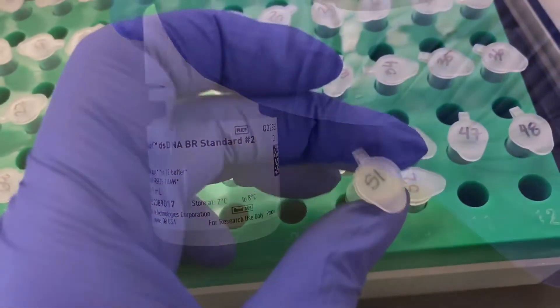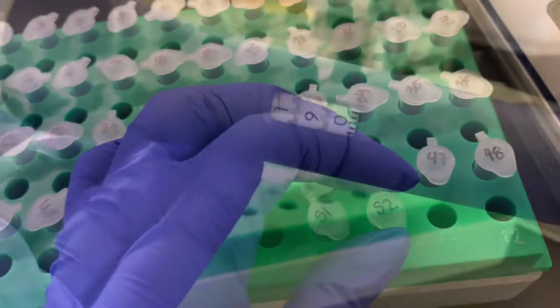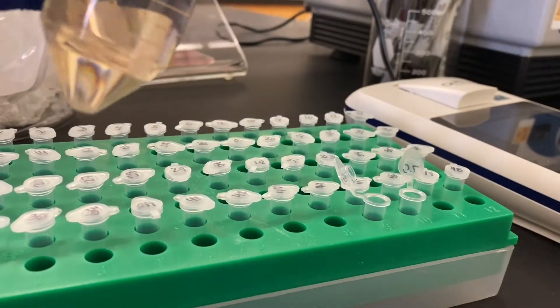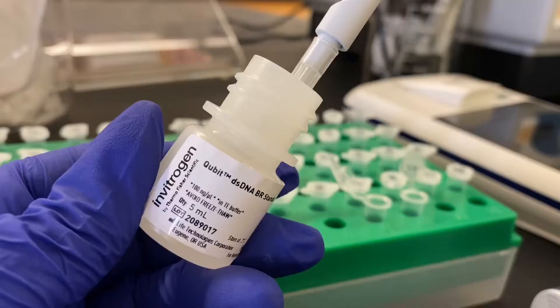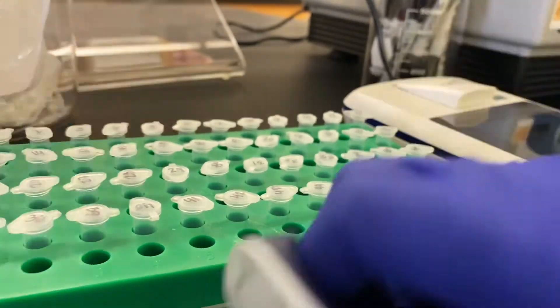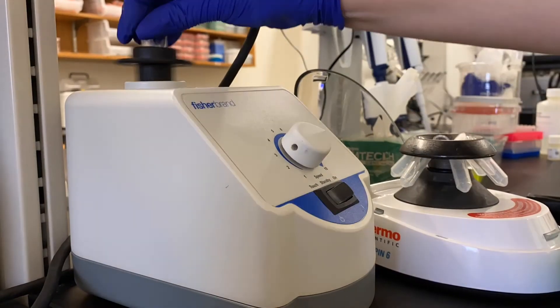The standards will be labeled one and two, and you'll add 190 microliters of the working solution to each of the labeled standard tubes as well as 10 microliters of the respective room temperature standard. Gently vortex and spin down each standard before reading on the fluorometer.